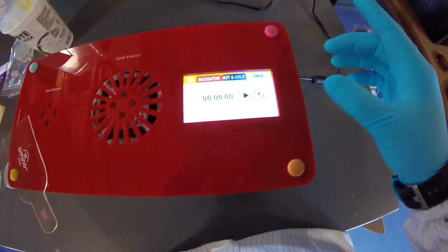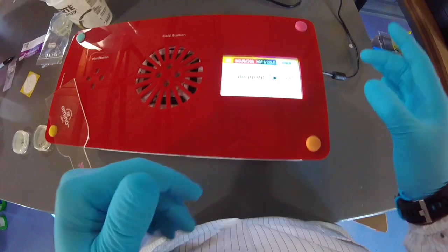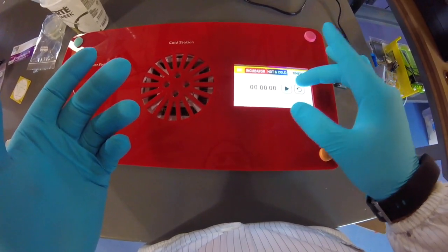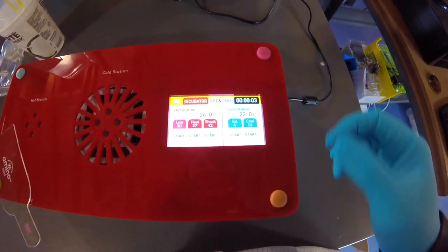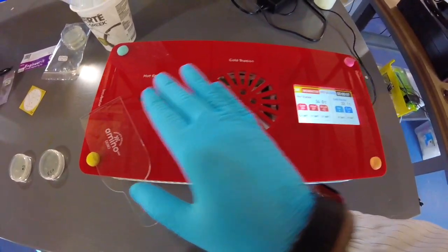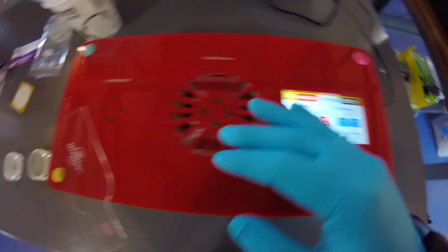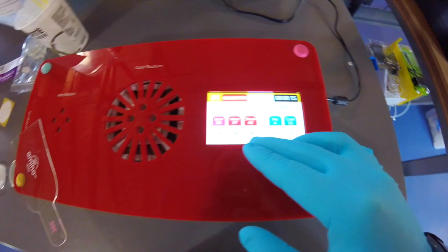Just really quick about the playground. You want to put it on a flat surface. On the screen here, we've got a timer. If you press go, and you move over, it'll keep going. We have two stations on top, a cold station and a hot station. The cold station can cool to ice or down to 16. The hot station, which is here, can heat to 30, 37, or 42 degrees Celsius.